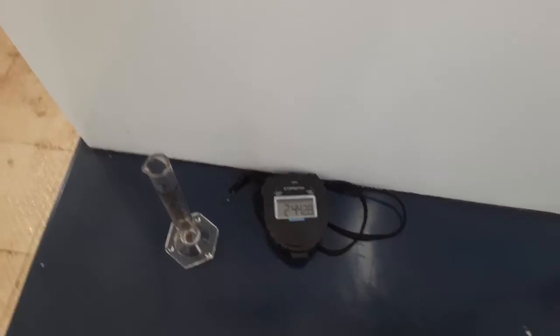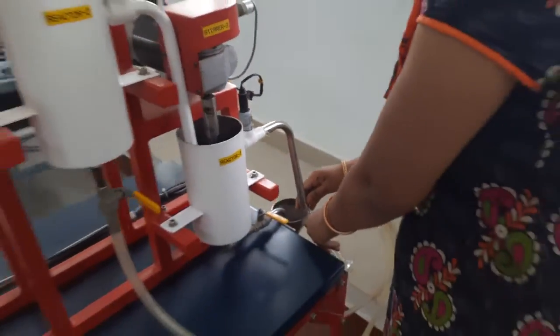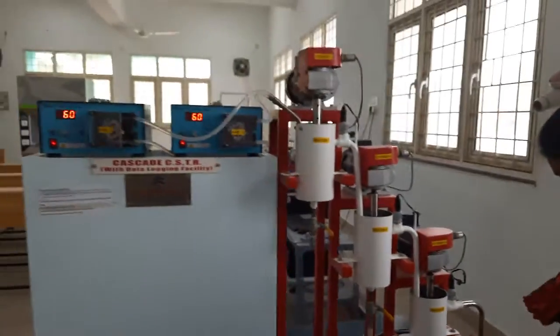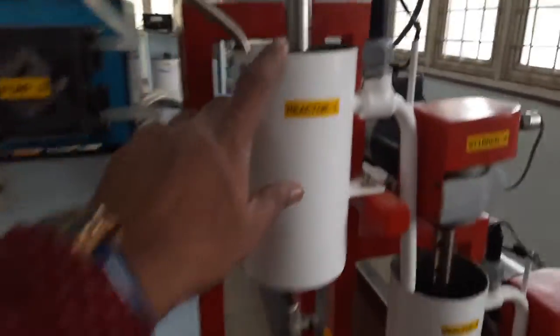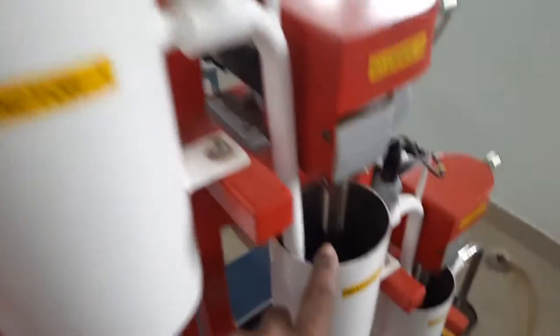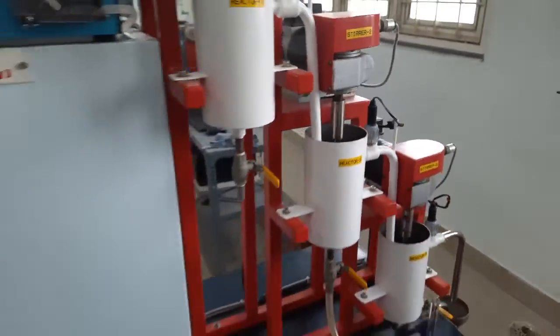After that, what will we do? We'll collect 10 ml of sample from the product stream of the third reactor. So we have to wait for that. First this reactor has to get filled, then the second reactor, and then the third reactor.